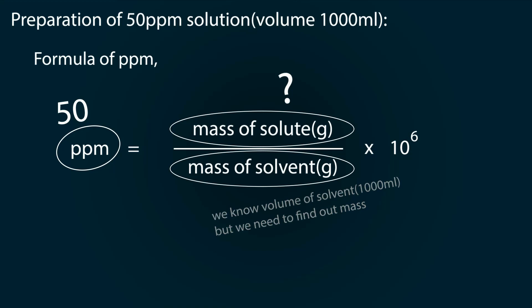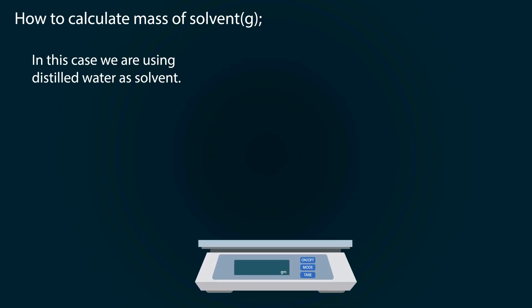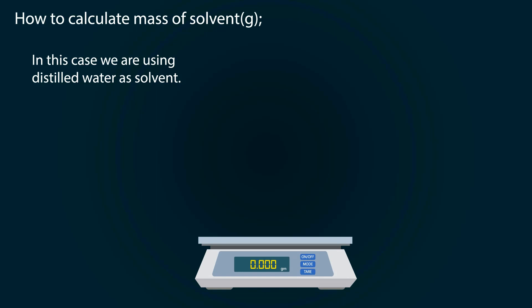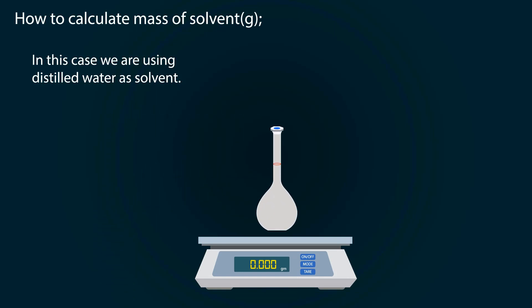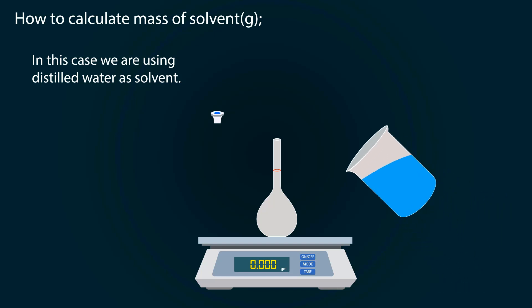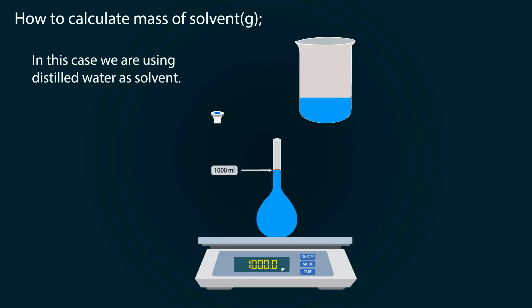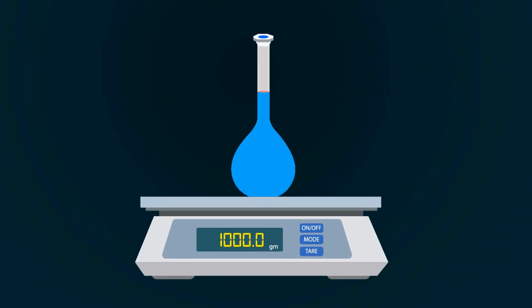We are taking distilled water as our solvent. Take a weight balance and power it on. Put the volumetric flask on it and tare it down. Open the cap and start adding distilled water into the volumetric flask up to the 1000 milliliter mark. Note down the reading — we get 1000 grams of solvent.